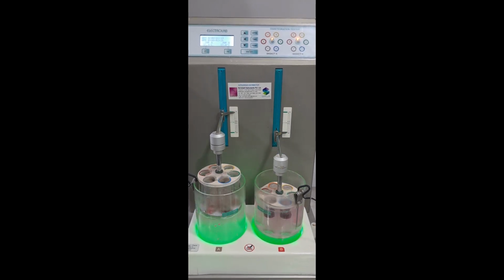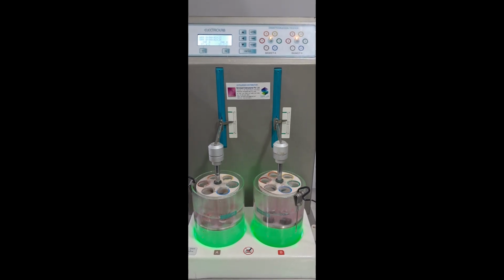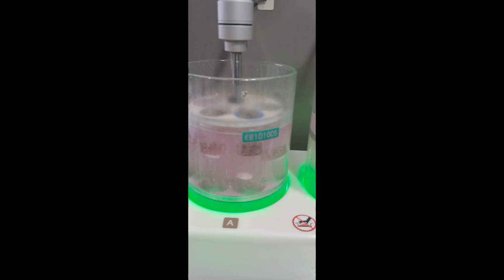Confirm mesh aperture with a go-no-go gauge. Check that tubes sit squarely and don't wobble when reciprocating. 5. Disc selection and placement.